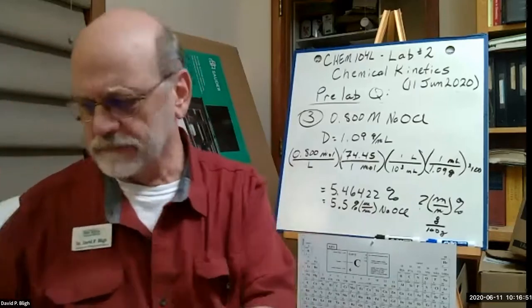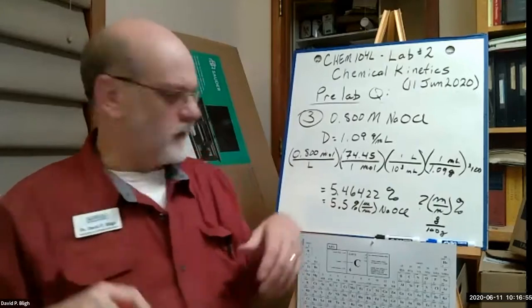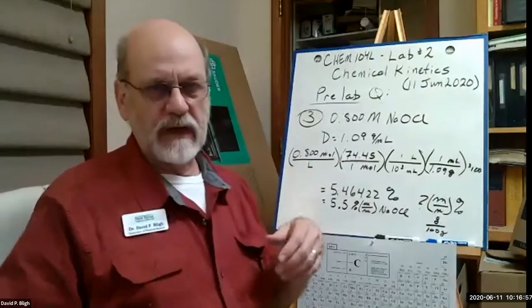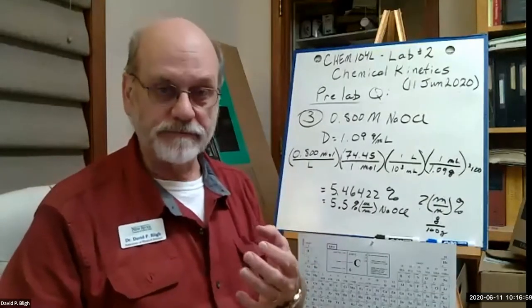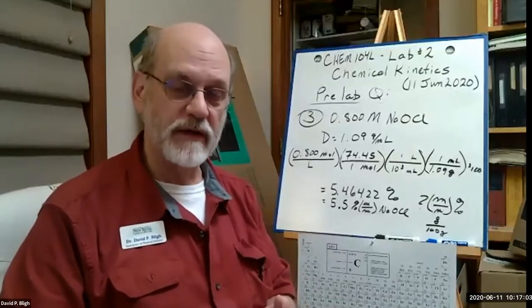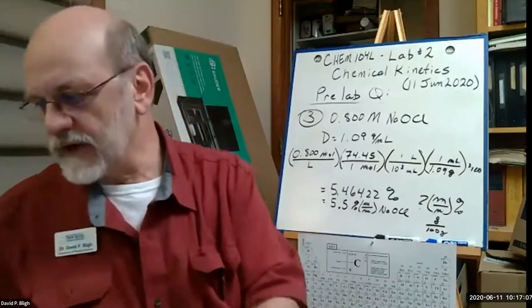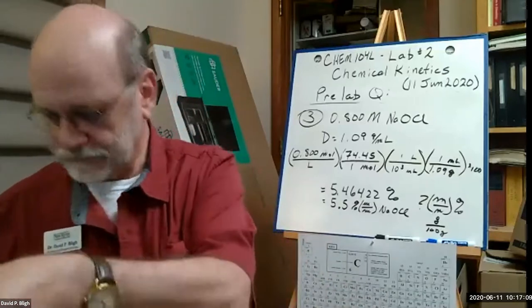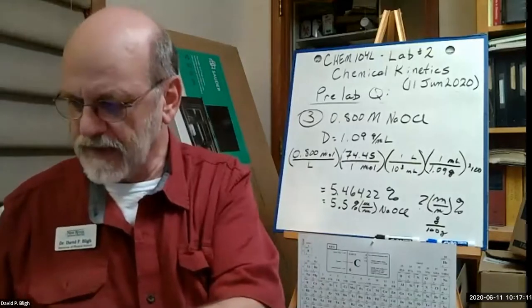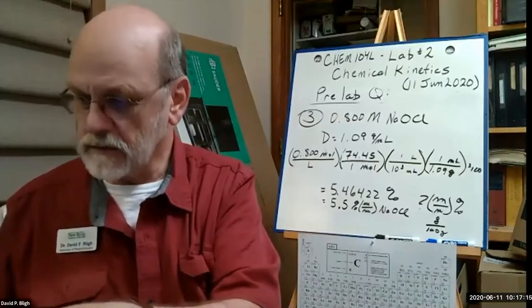Okay, so those are your pre-lab questions, and they give you a place to start for determining the concentration of sodium hypochlorite in your reaction vessel. Now, I think I've incorporated, where is it?